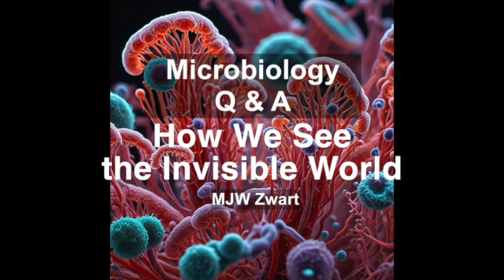One of the most fundamental techniques is called gram staining, which is used to differentiate between two major groups of bacteria. I remember learning about that. You stain the bacteria and they either turn purple or pink, right? Exactly. Gram-positive bacteria, which have a thick peptidoglycan layer in their cell walls, retain the crystal violet stain and appear purple. Gram-negative bacteria, on the other hand, have a thinner peptidoglycan layer and an outer membrane. So they don't retain the crystal violet and are counterstained with safranin, giving them a pink color.